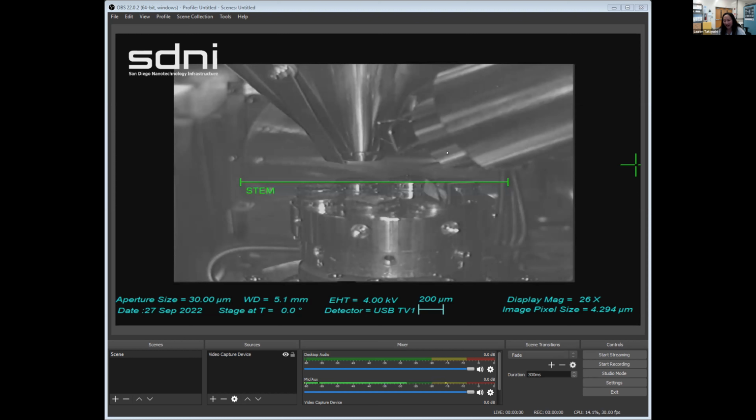So I guess if you have seen pictures of SEM images that are colored, they were probably photoshopped after taking. But yeah, let's get started.